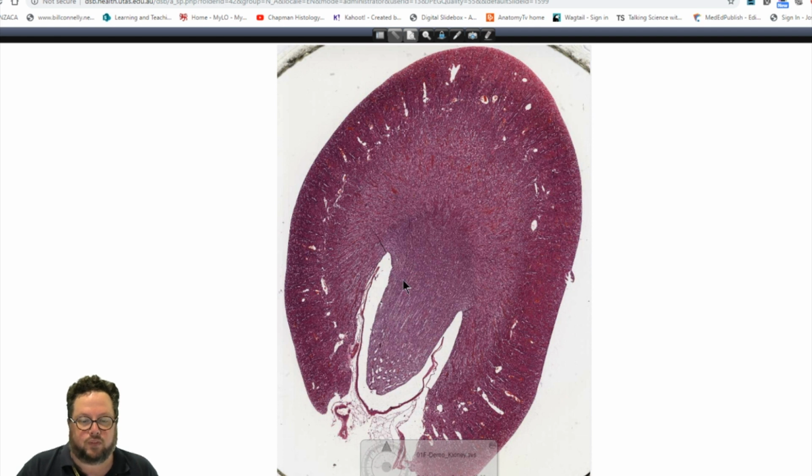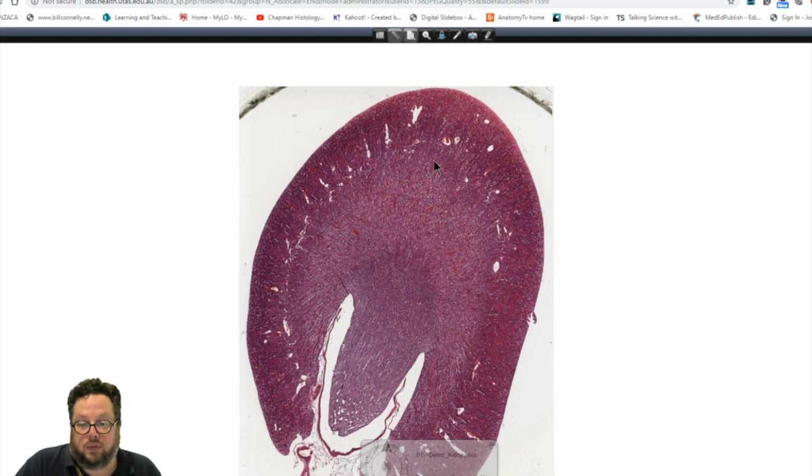I apologize for that. All right, so as I mentioned, here's our renal pyramid. So here's the apex. We've got these large collecting ducts emptying into here, so our urine drips out. It's collected by this calyx here, and this calyx is going to be the first part of the urinary system where we find urinary epithelium or transitional epithelium. But let's start with the outside.